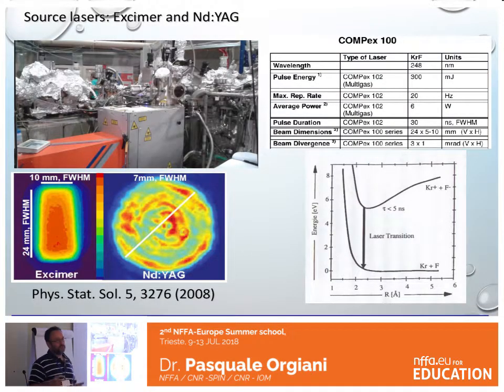What are the lasers used for PLD? Not a very fancy laser, it just needs to be very intense. For a lot of years, and only recently have they used a different kind of laser, but in 95% of the cases in a PLD lab you will find an Excimer laser, which in the old-fashioned style would be orange. Now you will find the same kind of laser, but it's gray just because Coherent bought Lambda Physik. But basically 95% of the people use the same laser. It's more than 20 years.